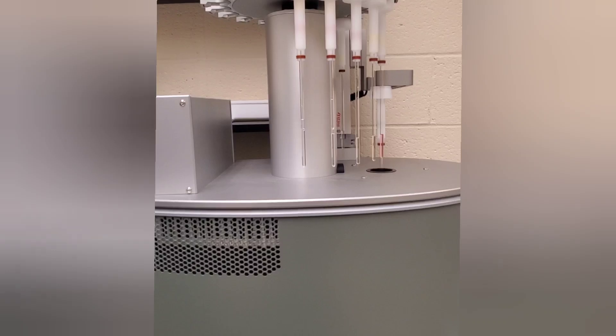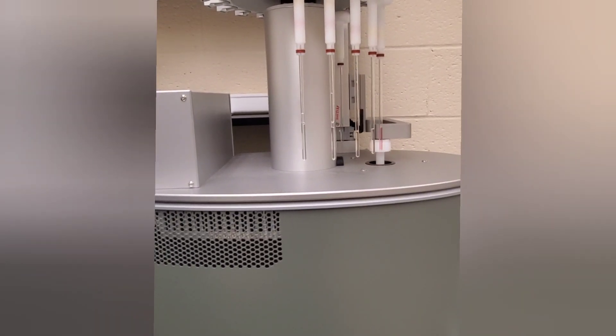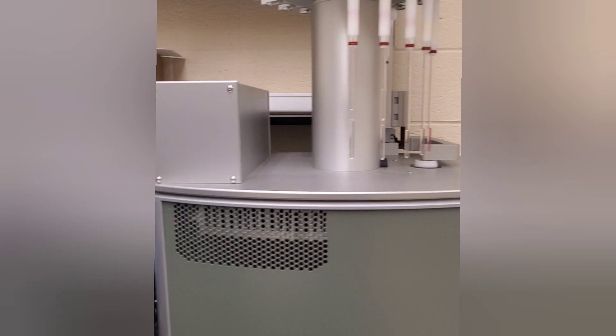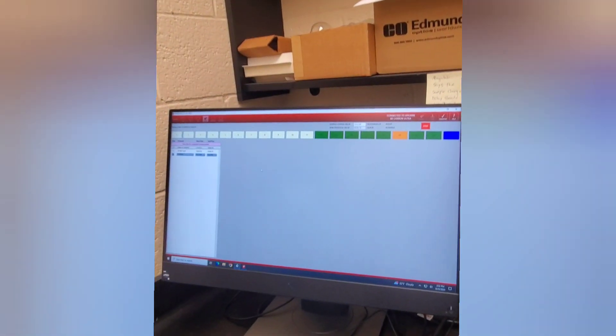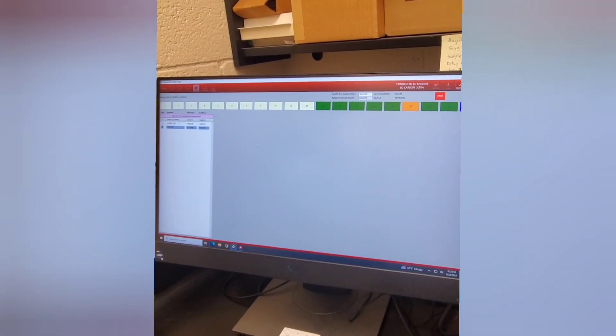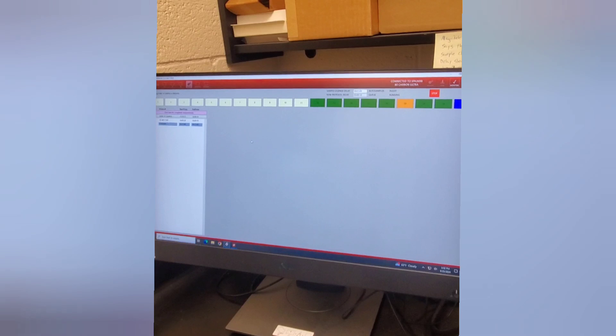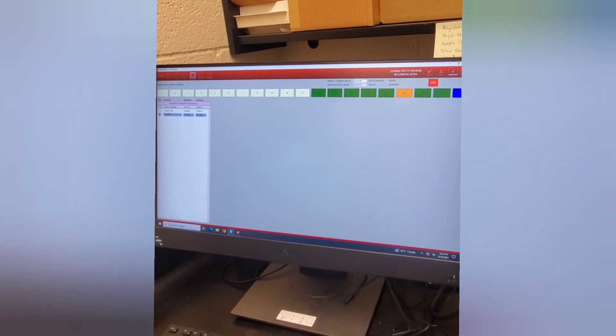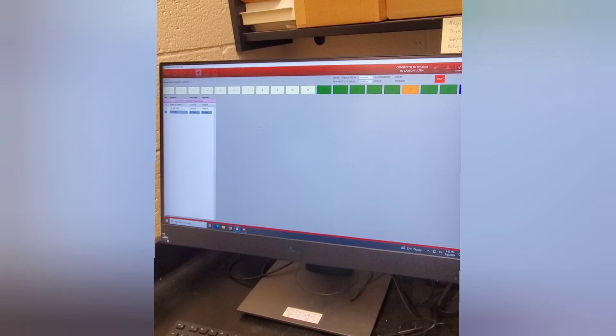The analysis will begin after a couple of minutes and will take about 20 minutes to complete. Before we come back and look at our spectrum, we're just going to walk away from the instrument for a while and let things happen. At this point you can go off and get a coffee.